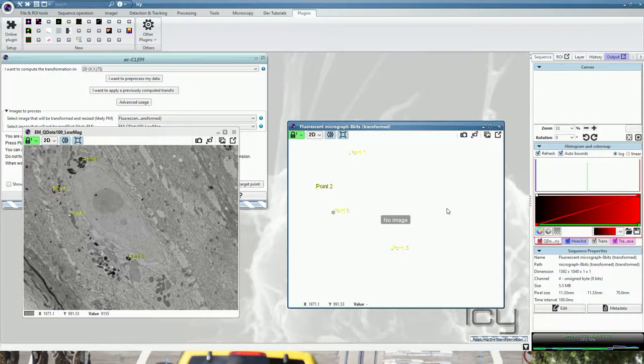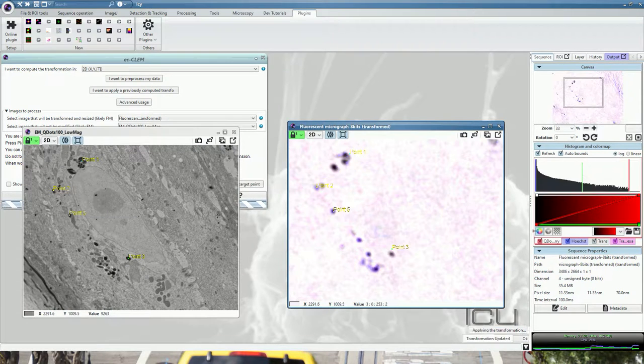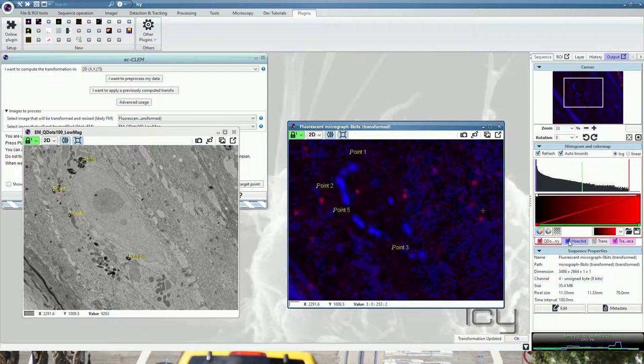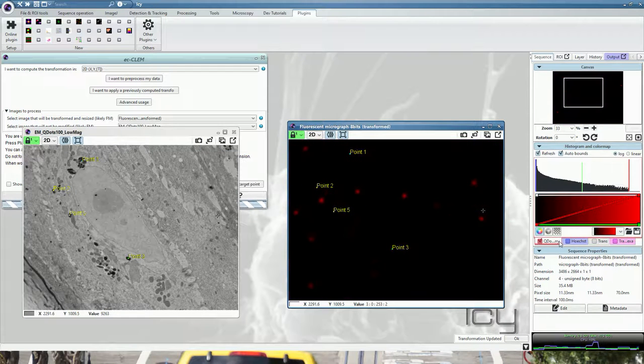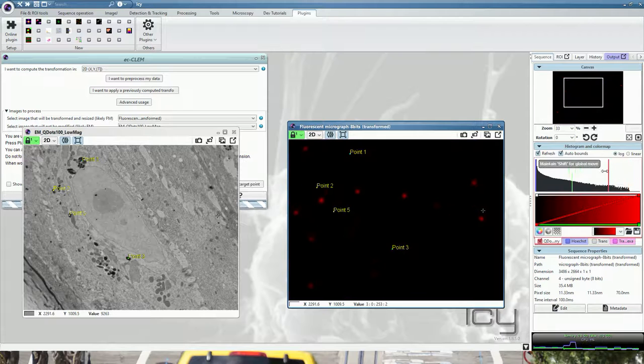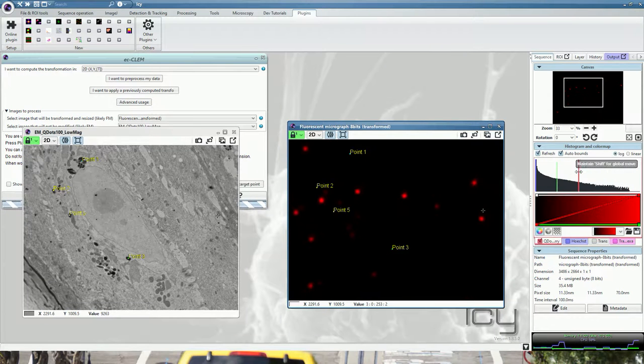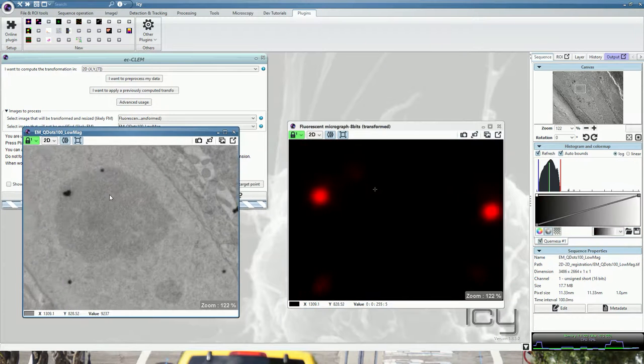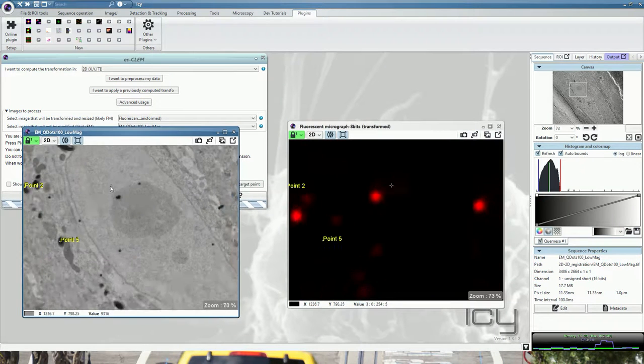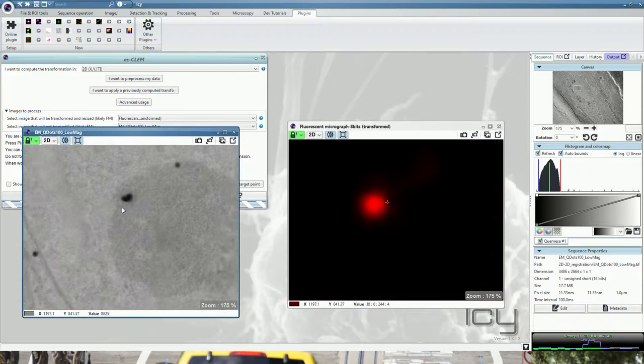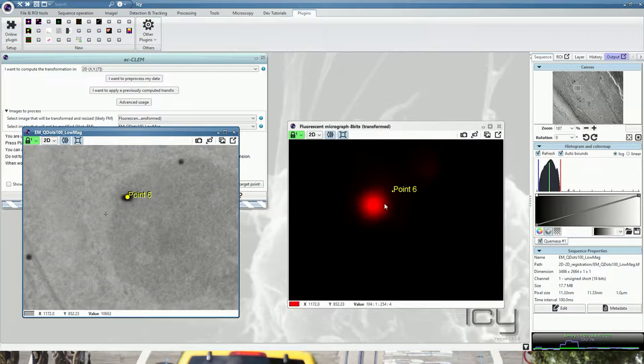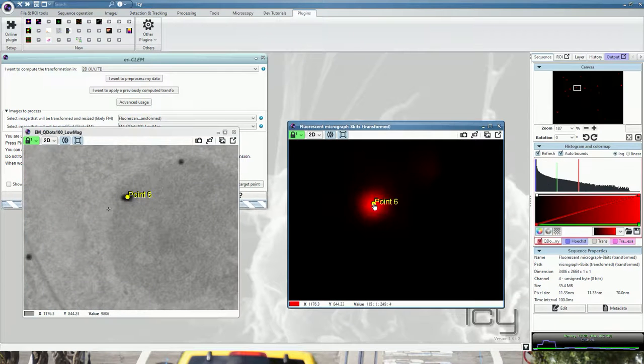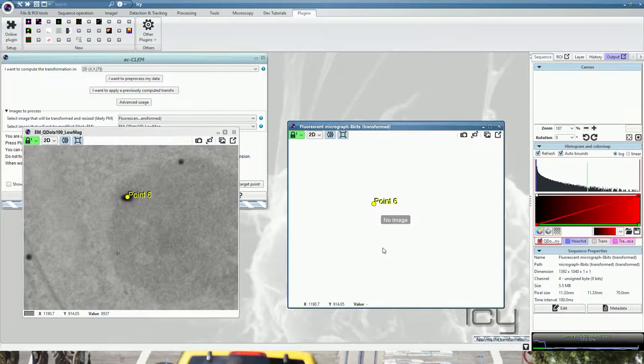Now if you want to be more precise, what you can do is go into the quantum dot channels, remove the other channels, boost it a bit, and then you can use the quantum dots as accurate landmarks with straightforward identification and locate your points.